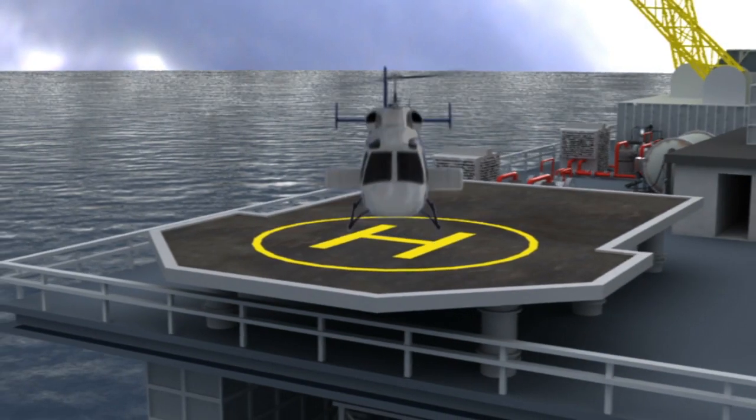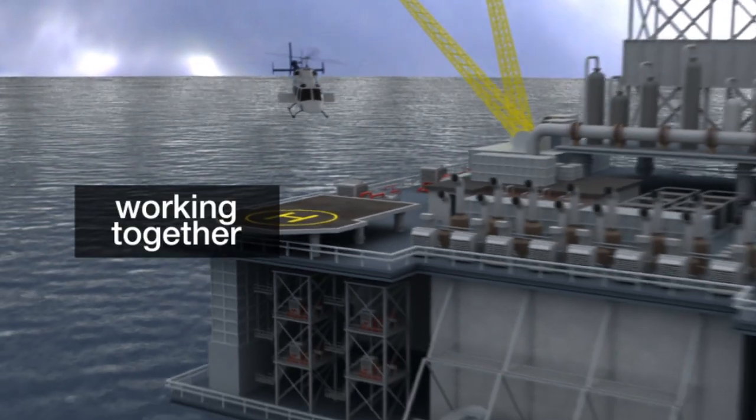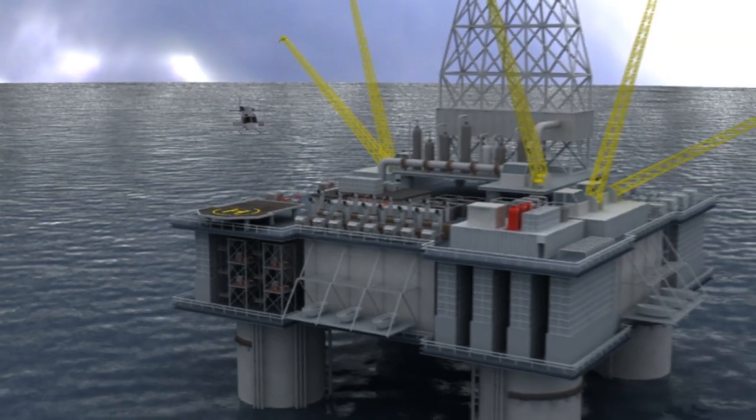Advanced Sensors strive to meet your needs in produced water measurement. Working together, we will identify the needs and provide solutions.